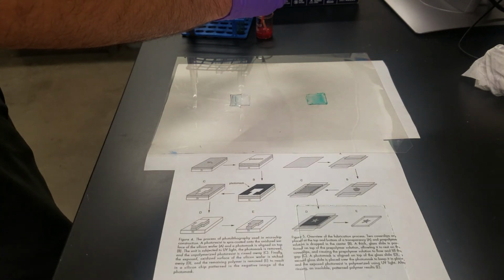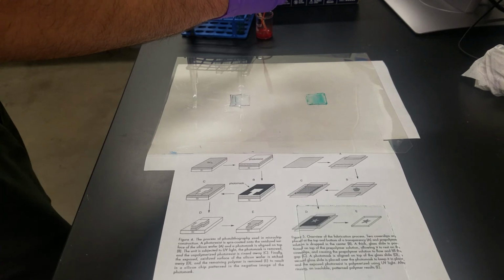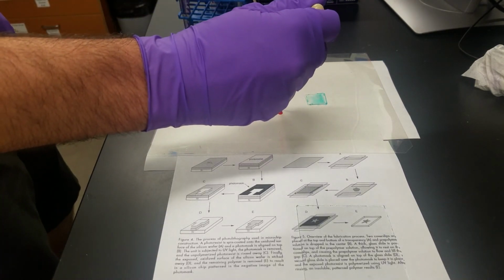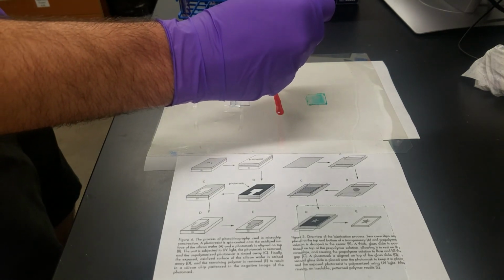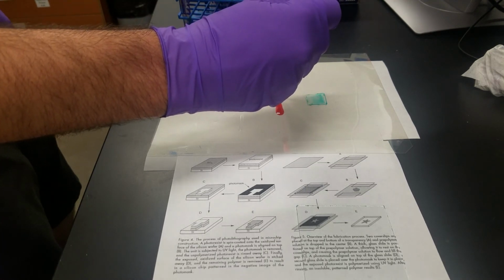Here we're collecting the polymer mixture. The polymer mixture was made by mixing the cross-linker, the monomer, and the radical initiator. A little bit of effort because it's difficult to mix them. And then also some food coloring. So just normal food coloring. I used probably about 50-50 red and yellow because I was hoping for an orange color, and that didn't really pan out the way I wanted it to.